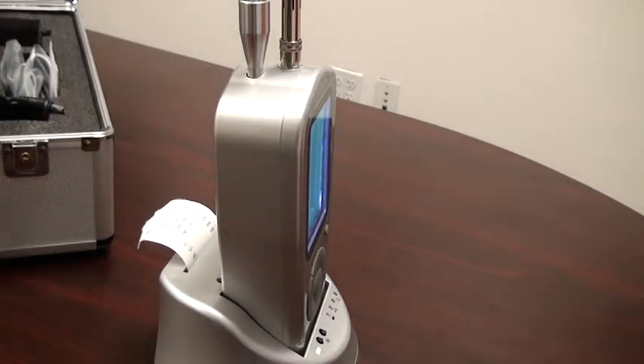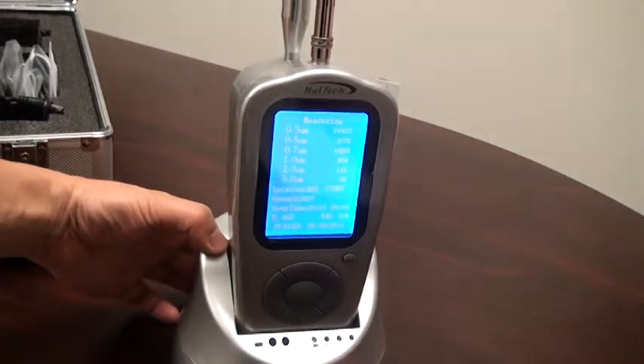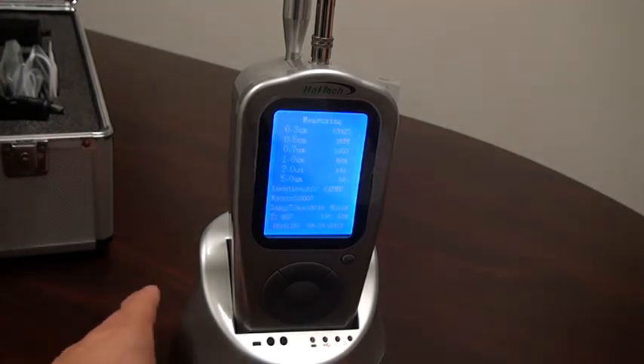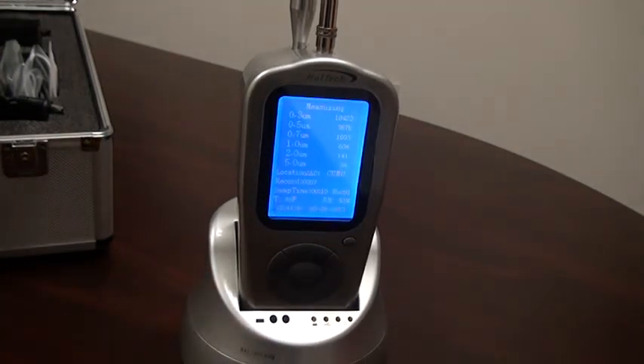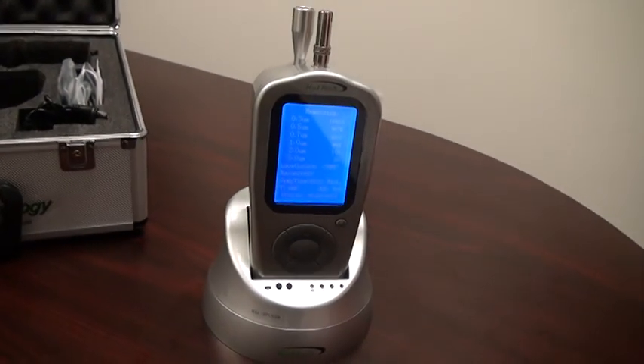HAL Technology typically recommends yearly calibration for this specialty instrument to maintain accurate results. The unit should be returned to HAL Technology for calibration. Beware of counterfeit products not manufactured by HAL Technology. Since a new unit must be calibrated before shipping, customers should expect authentic instruments to be shipped directly from our U.S. facility. Thank you.